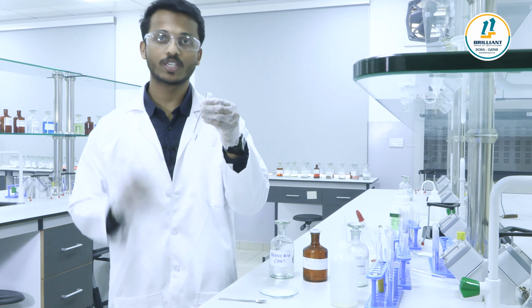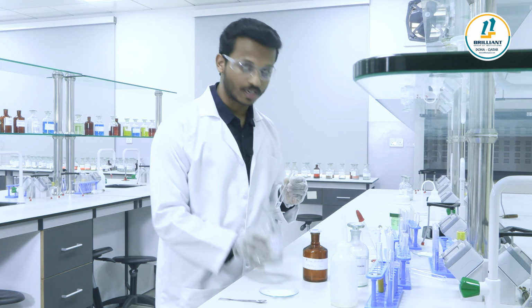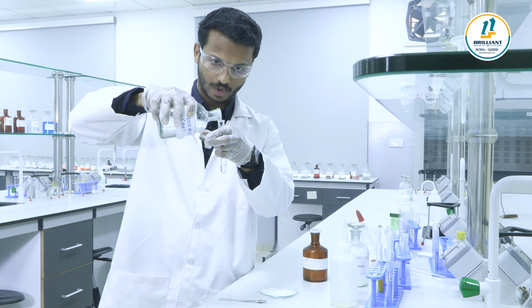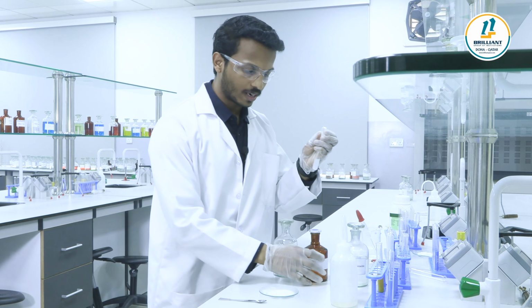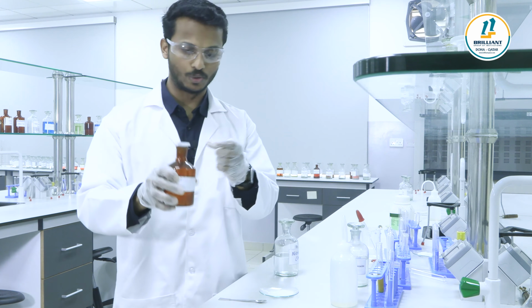To which first you add a small amount of dilute nitric acid. Then add a few drops of silver nitrate solution.